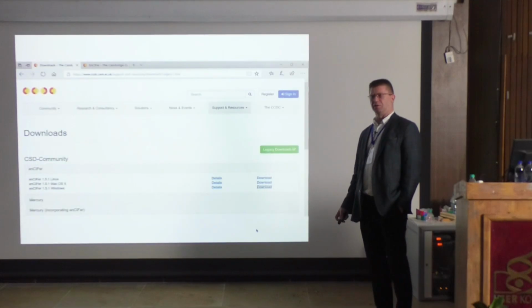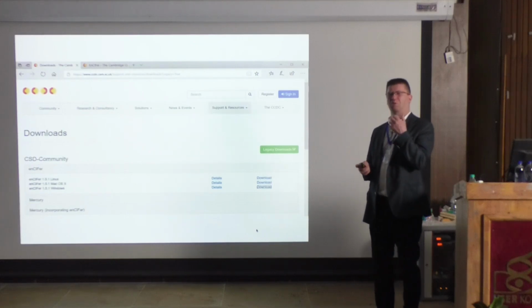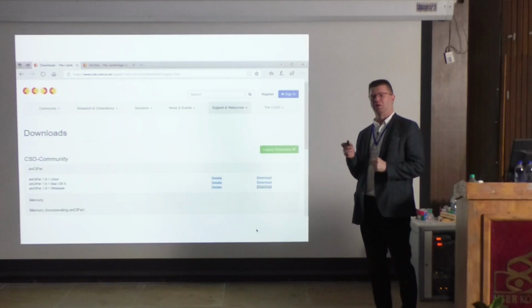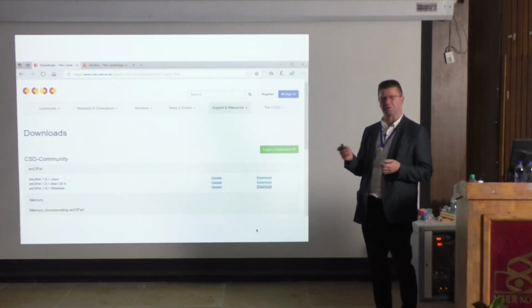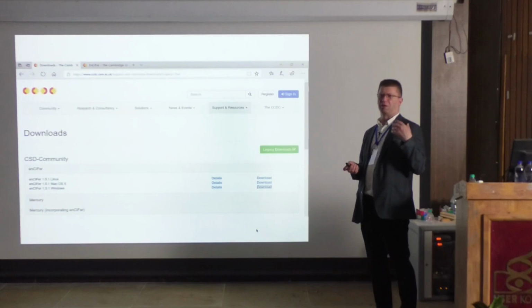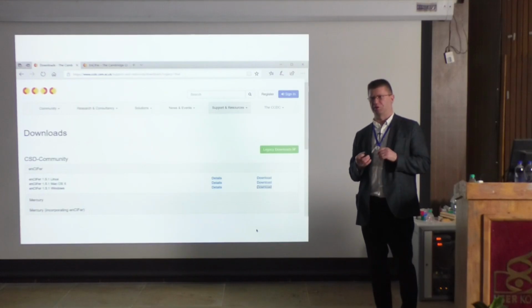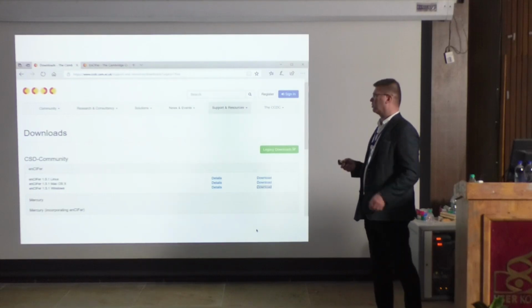So what to do then? Because this is the thing we have. We have finalized everything, but then we want to have the final. We have done the check by ourselves. We have seen the list of coordinates, and we have seen there are bond distances and angles and all these kinds of things. It's also shown here in a cartoon, but I will also show you that we can use a program to analyze our structure visually. But this is the printed version, but you can also do it visually.